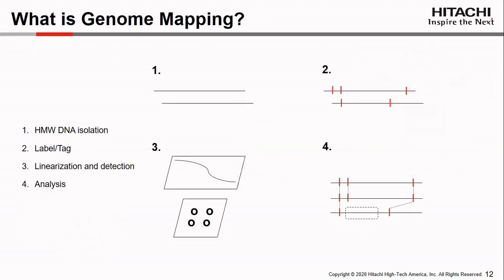All of this points to an opportunity for genome mapping. This single molecule long-read approach to examining structural variation in the human genome is interesting in that it follows a familiar workflow, can detect de novo events, and offers the throughput and price performance needed to transition to the clinic.